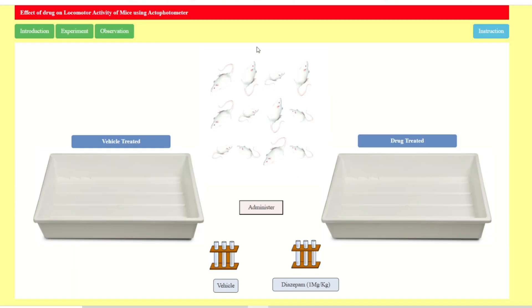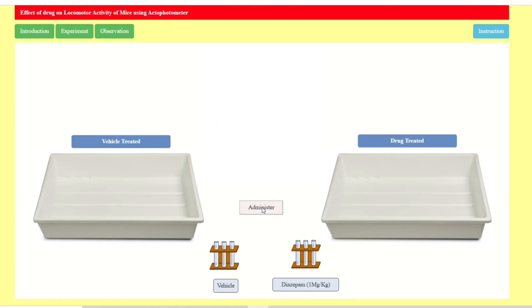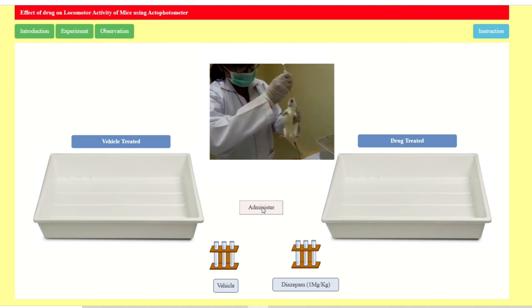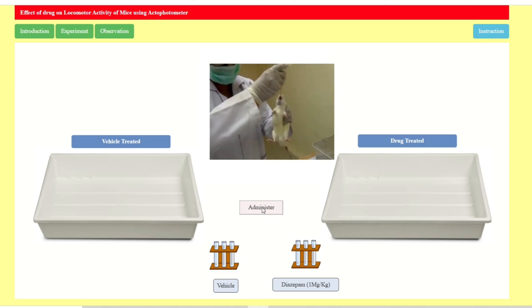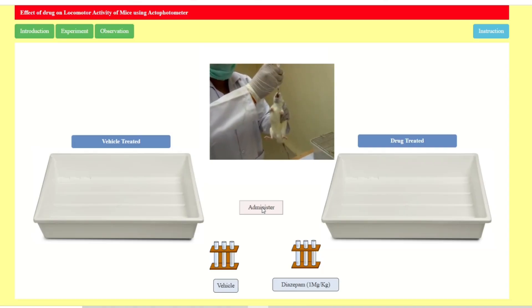Now we will administer the drug. You can see the two groups — vehicle treated and drug treated. For the vehicle-treated group we give saline or the solvent in which the drug is dissolved. The drug here is diazepam, which is a CNS depressant, not a stimulant. Here you can see the oral dose being given to the animals.